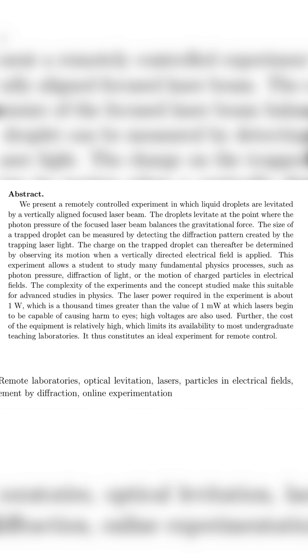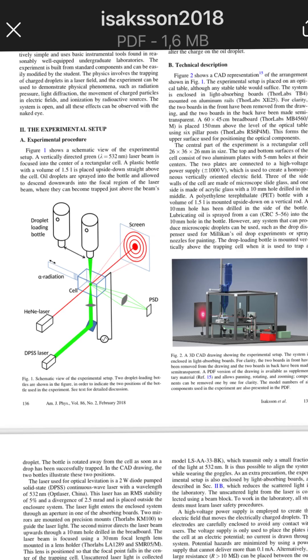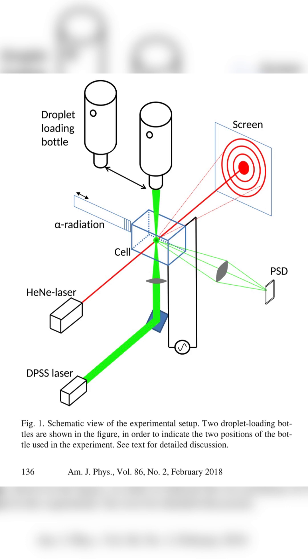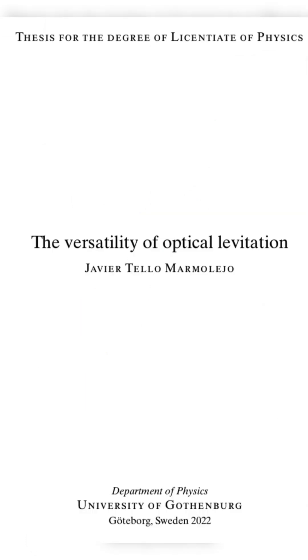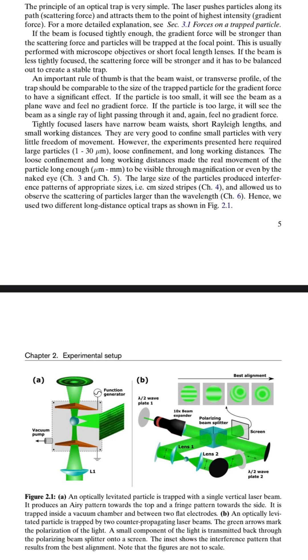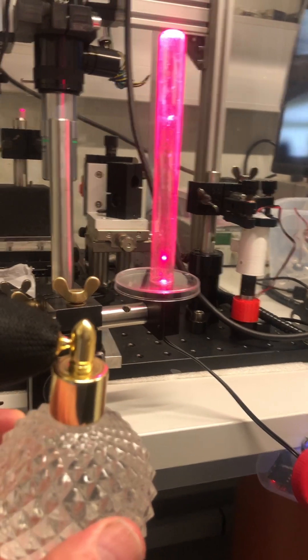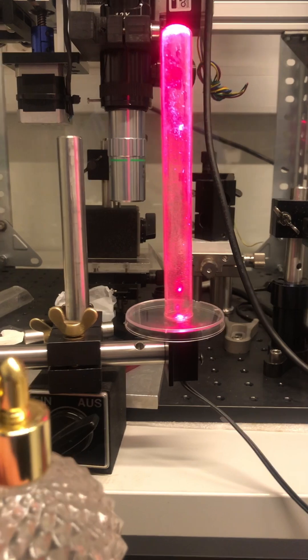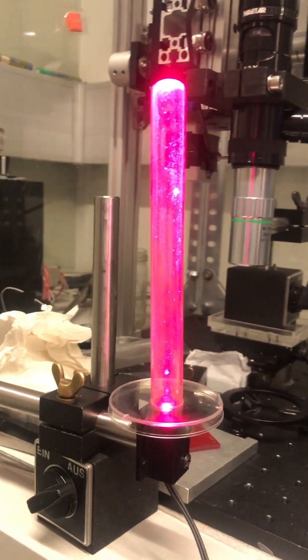2 cm focal distance and laser power 170 mW. Today I learned to trap a glycerol droplet with a DVD laser diode, 170 mW.